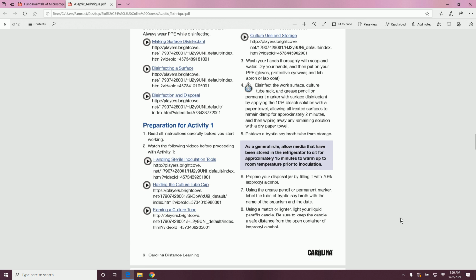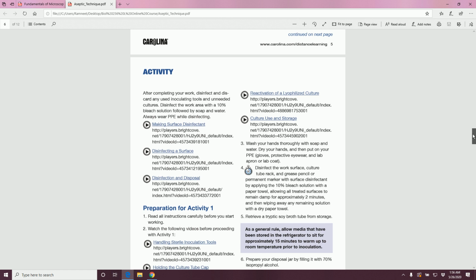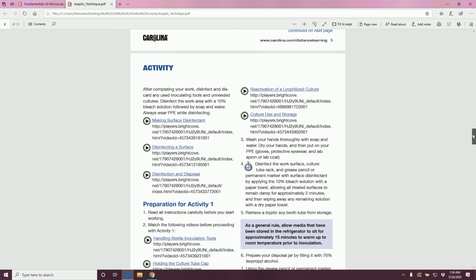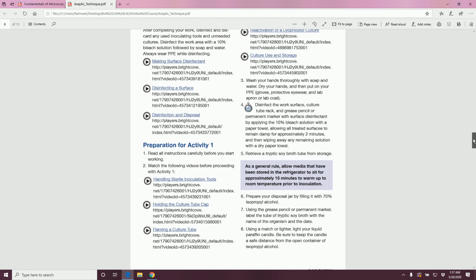Okay, how you open the culture, how you take care of the lid, how you use the inoculating loop, how you transfer on a plate, how you run a broth. All these videos are here, and you need to watch them, and then you have to perform the experiment at your home, and you are going to show me the results. You submit the results.